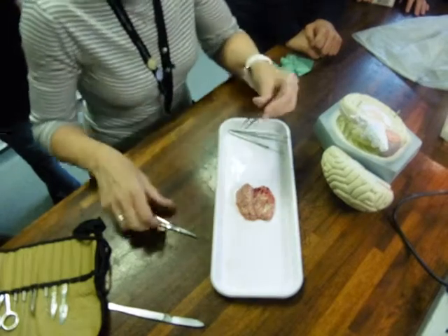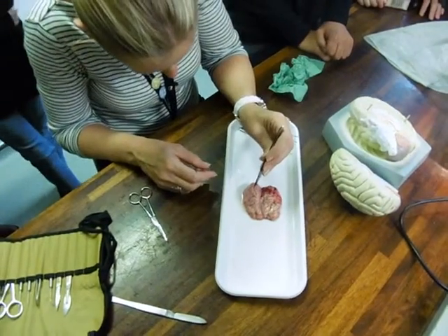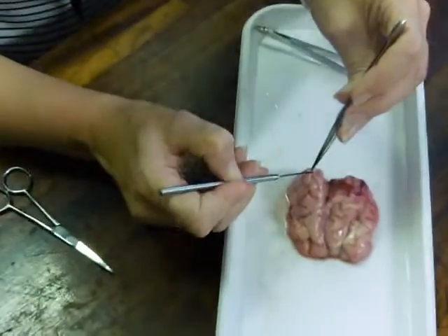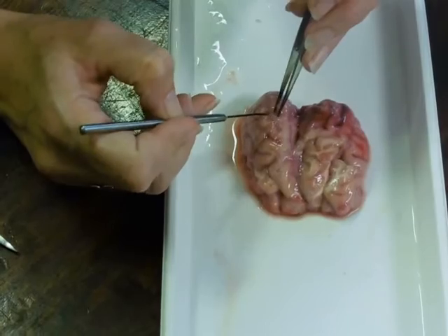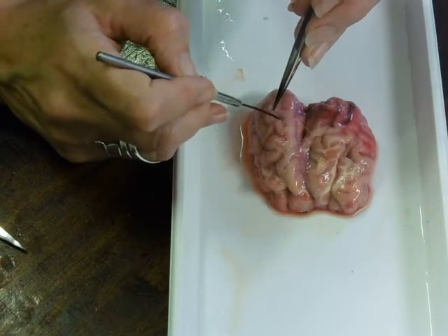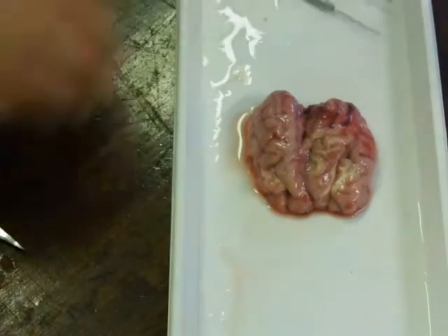So here we go. Like I know what I'm doing. Right. So what I think I'll do is I'll just try and see. Yeah, they're the membranes, aren't they? Oh yeah, no, it goes down. Oh yes, so the membrane's over the top. It's holding it all together, and there's fluid between the membranes. Have you had a spinal fluid? It goes all the way down your spine as well. Right, I'm just going to cut it.